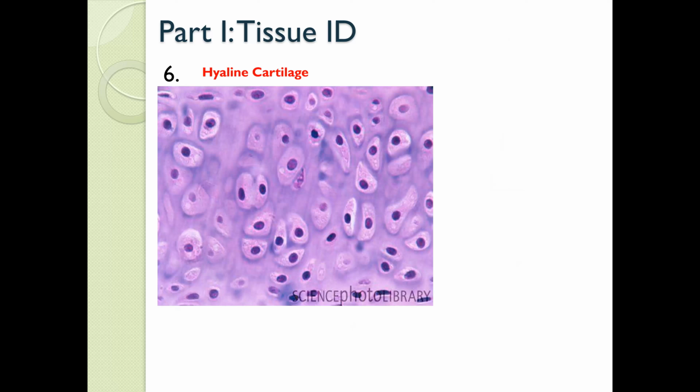This is hyaline cartilage. So this is a type of supporting connective tissue. We can identify this as hyaline by, again, there's no lumen. That eliminates all the epithelial tissues. Then we notice that we can see cells in these bubble-like structures. So what all of these are is the little dark spots are the chondrocytes, which are the specialized cell in cartilage, and the bubble-like structure is the lacuna that the chondrocyte lives in.